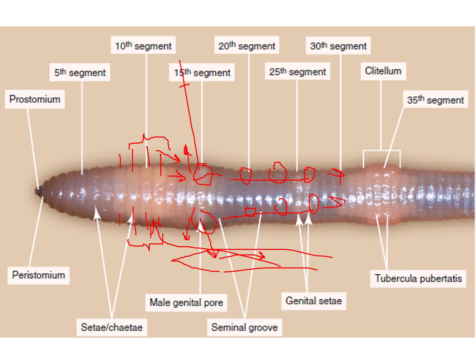So why can they not self-fertilize? One reason is that the sperms mature earlier than the eggs during the breeding season. So the sperms are mature, but they cannot fertilize eggs. They are transferred between individuals, and later when the eggs mature, these sperms from the spermatheca could come out and fertilize eggs.